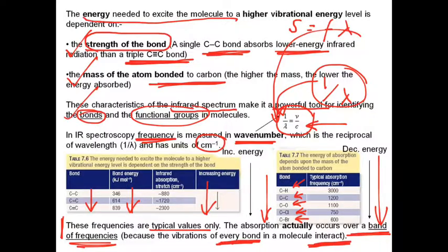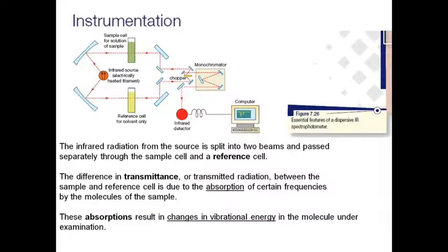Now, what we're looking at here is some instrumentation. This diagram is extremely complicated and hard to work out. I don't think it's particularly well drawn, but the essence of it is that you've got a little chopping unit in there.